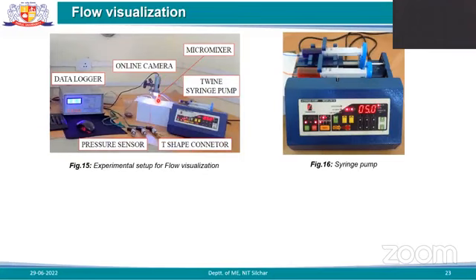And we can calculate the outlet pressure and inlet pressure with the pressure sensor. Whatever pressure data we are getting is loaded in Excel format on the computer. So this is the experimental setup, showing how this kind of experiment is done. If anyone is interested in doing research in this field, they can carry it out.